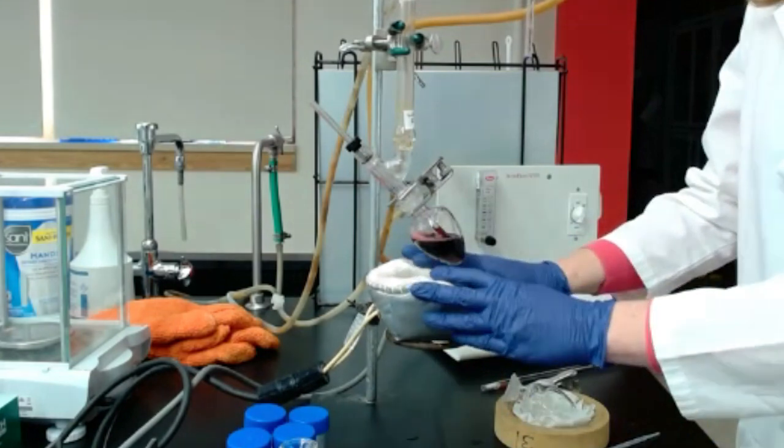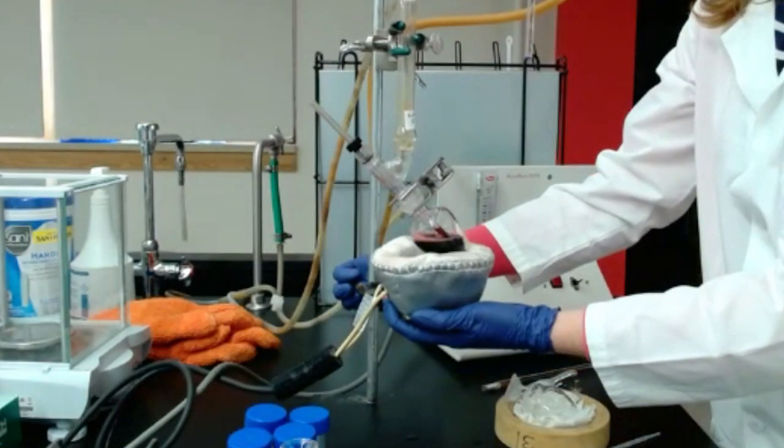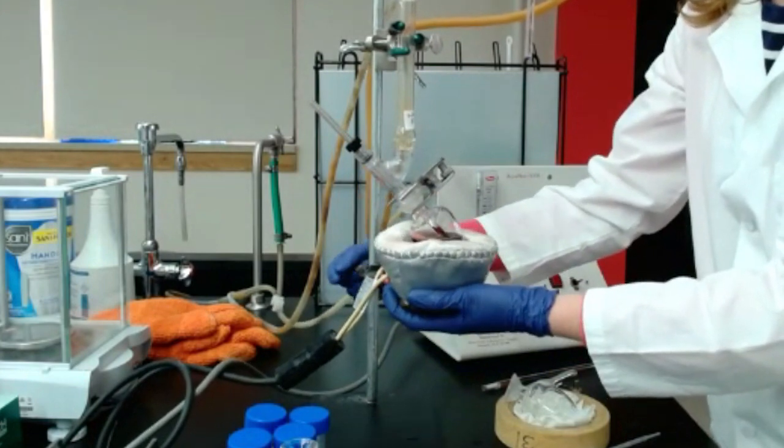That becomes hot. So don't burn yourself, because heat has risk. Don't burn yourself, that's not the goal.